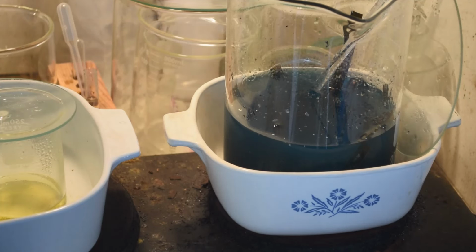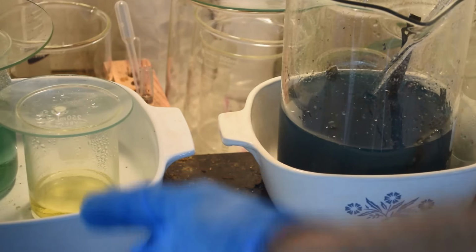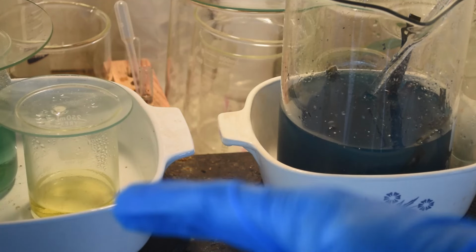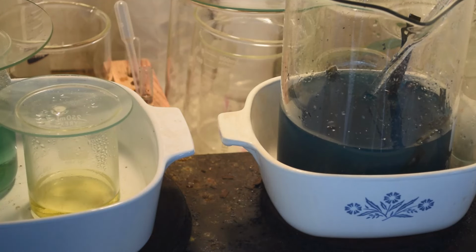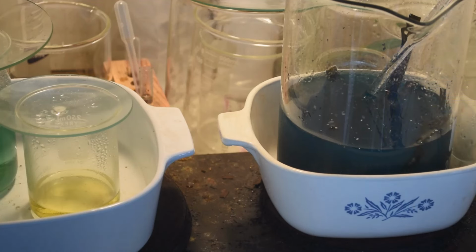And I'm also thinking that dissolving the palladium in nitric acid like I did over here was a good test to tell us whether we had palladium or not, but really this is not the way to refine palladium. I'd want to dissolve it in aqua regia. So if it comes to refining the palladium, I'll use aqua regia instead of nitric acid to put it in solution.